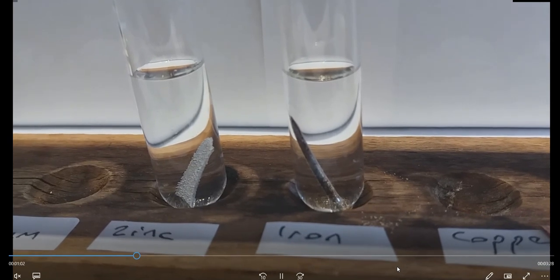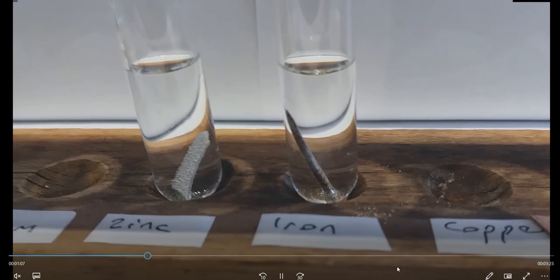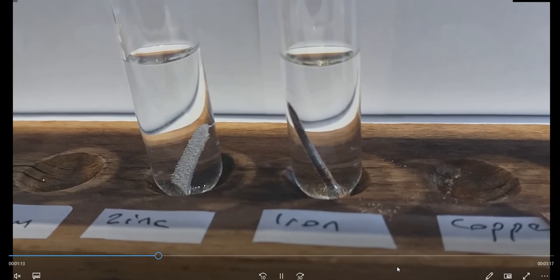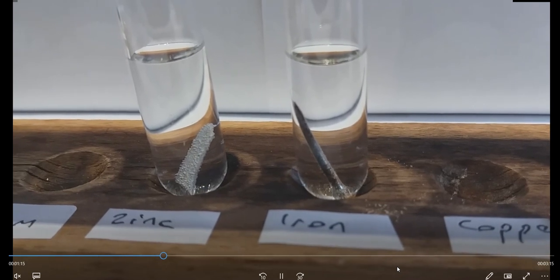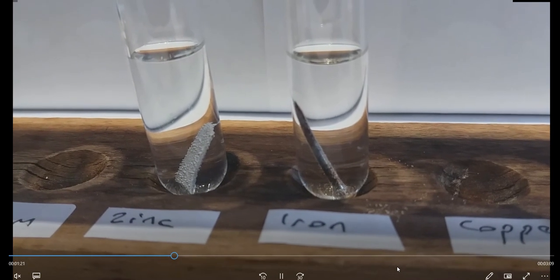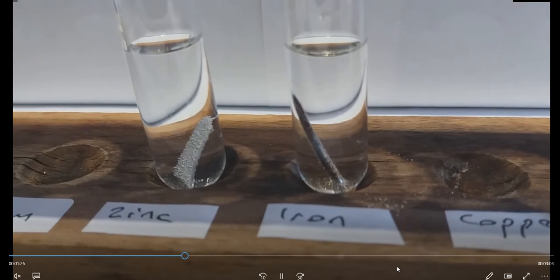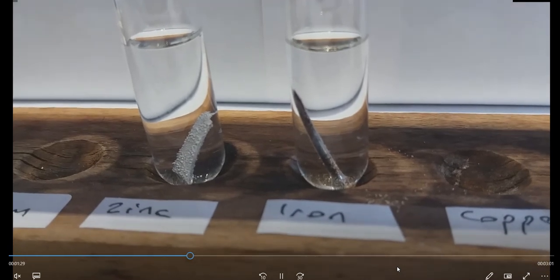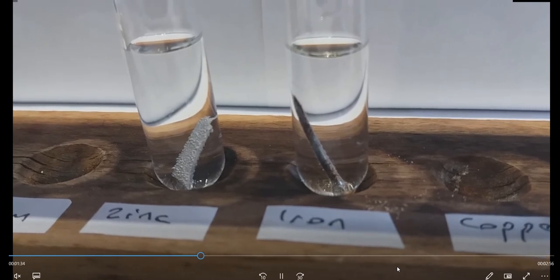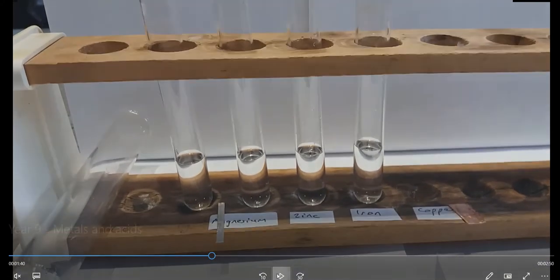Now keep in mind, sulfuric acid we're going to call hydrogen sulfate. So zinc is reacting with hydrogen sulfate, and that's giving us zinc sulfate plus hydrogen. And those little bubbles are the hydrogen gas being given off. Now look at the iron. Can you see that it's reacting as well? It's not as fast. In fact, the bubbles are being given off very, very slowly, but it does react. So zinc and iron are both above hydrogen, and they're reacting with hydrogen sulfate, sulfuric acid, giving us the metal sulfate plus hydrogen.